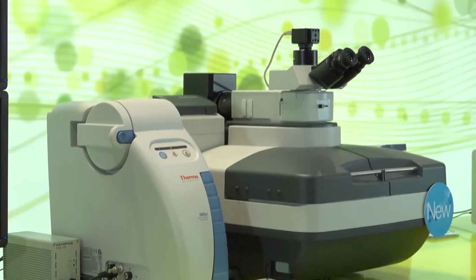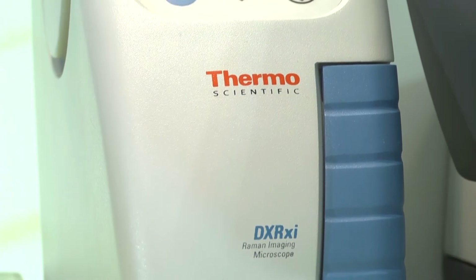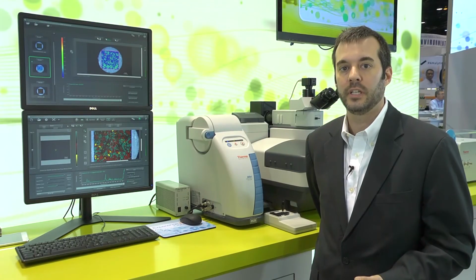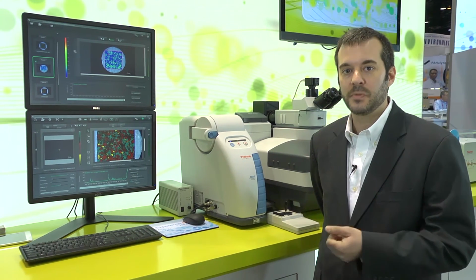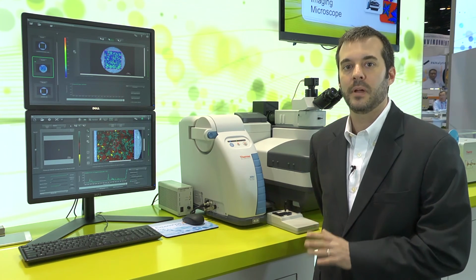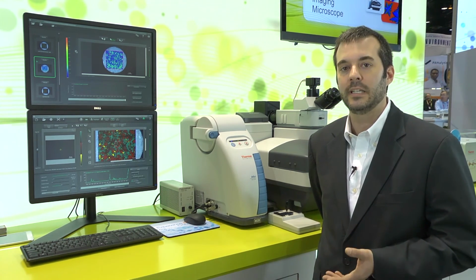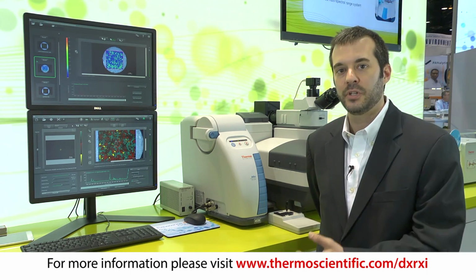Much more than just a faster spectrometer, the DXR XI is a whole new way of thinking about Raman imaging. So we built expertise into the system to allow users to solve problems much more quickly, using a visual, image-centric analysis that really takes high-speed data acquisition to a whole new level. So you get real-time, immediate, instant gratification, and the ability to interpret your results quickly and efficiently. This lets you get onto your next problem and continue pushing your research forward.